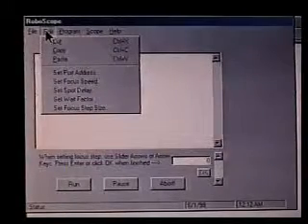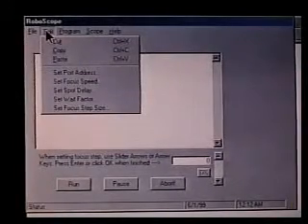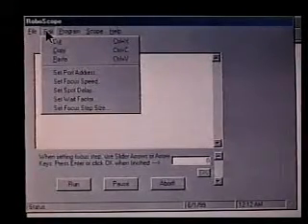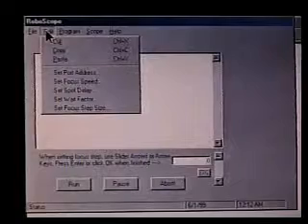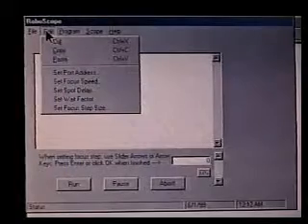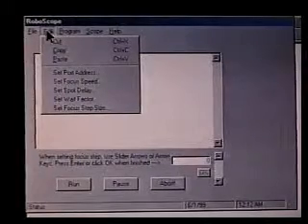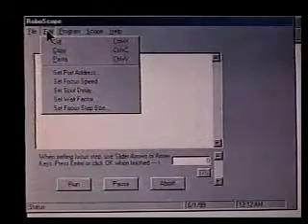The Edit menu supports typical editing functions and lets you fine-tune some parameters, which we'll talk about later.